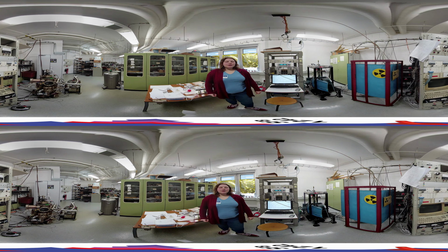The sample is mounted into a closed cycle cryostat. Helium gas is pumped with high pressure into the cryostat where it expands and cools down the sample down to 4 Kelvin. Therefore there is no need to fill the chamber with liquid helium.